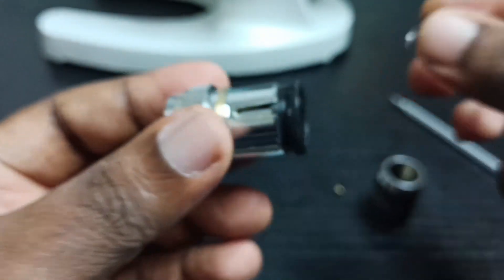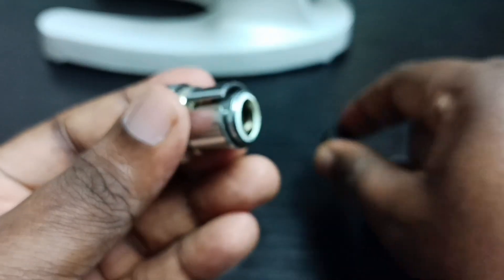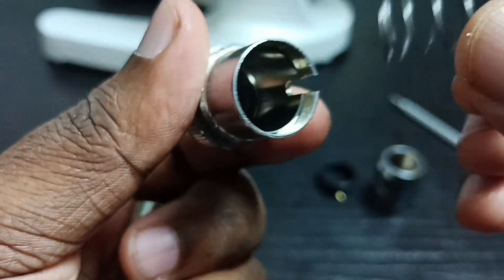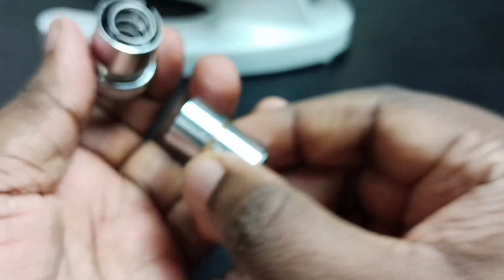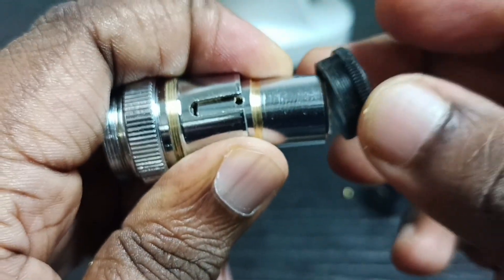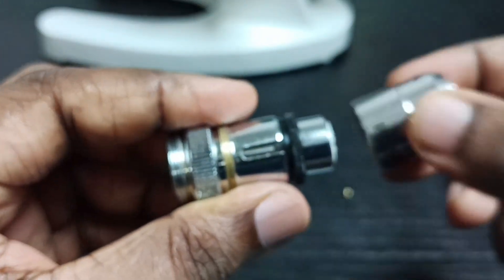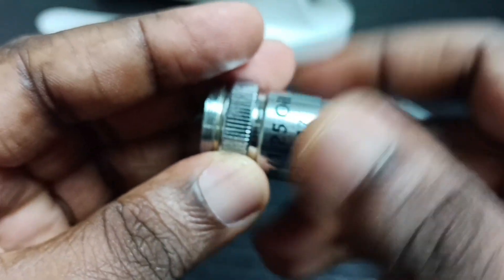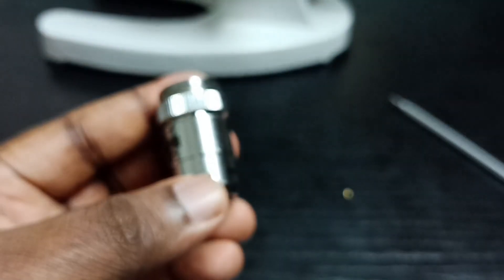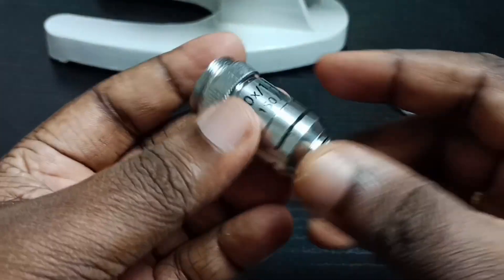Don't forget to put this spring. This spring you have to put inside, then this part, then this plastic, then that — that's all. I didn't put this screw because I will do that later — I just want to show you how we can assemble everything back after cleaning.